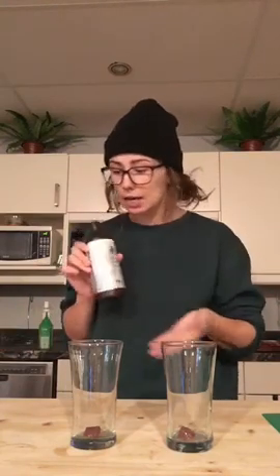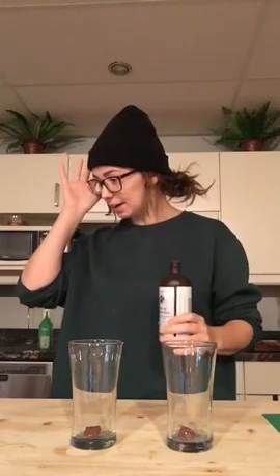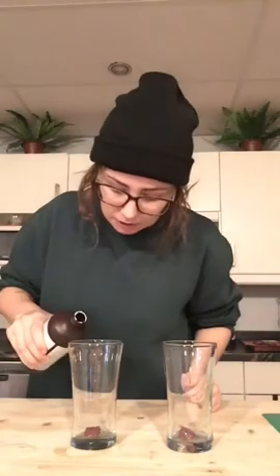This is my 3% hydrogen peroxide. We're doing part A, so I'm going to place a thin layer of 3% hydrogen peroxide into the cup with the liver.